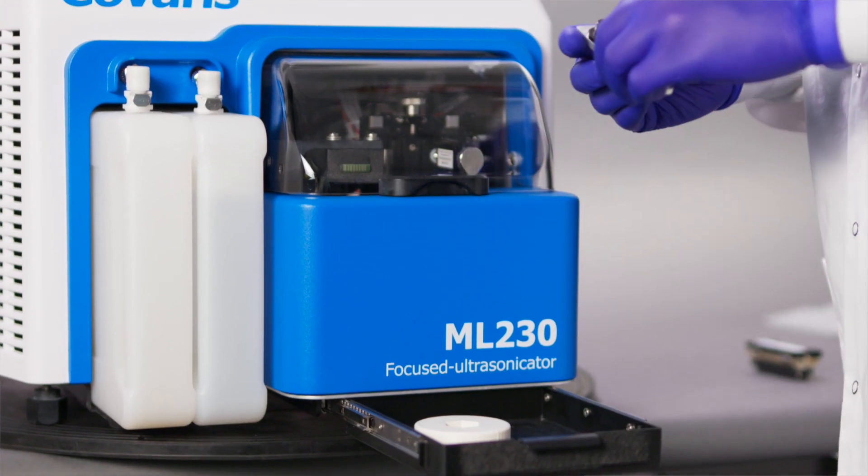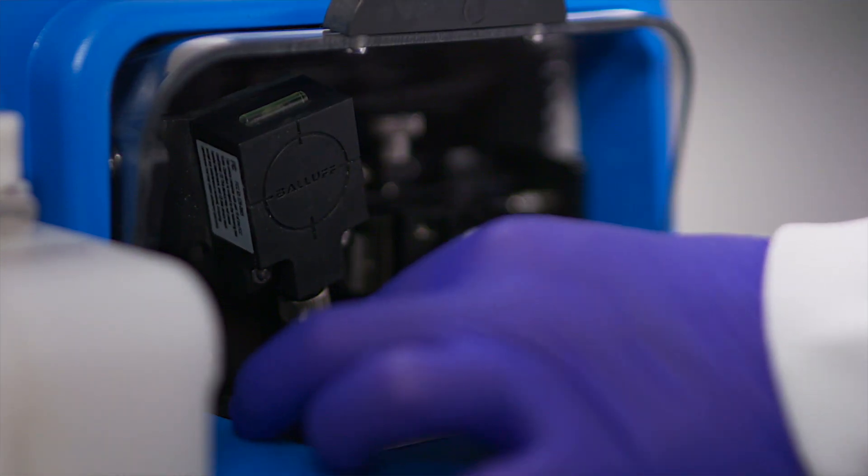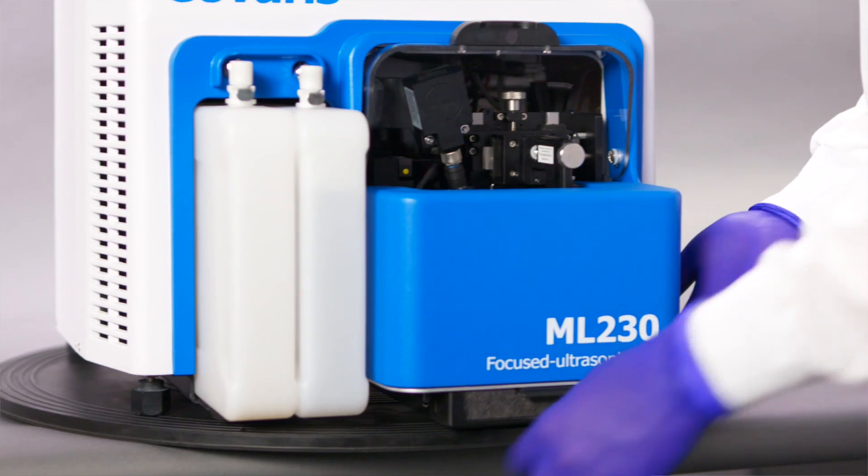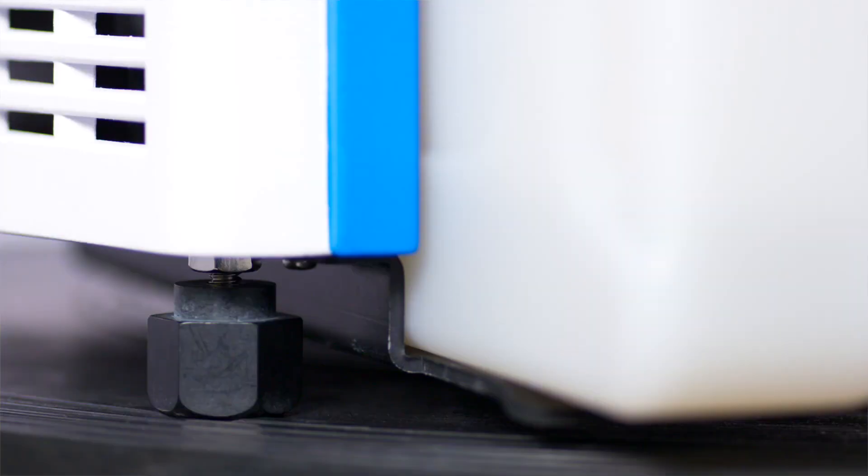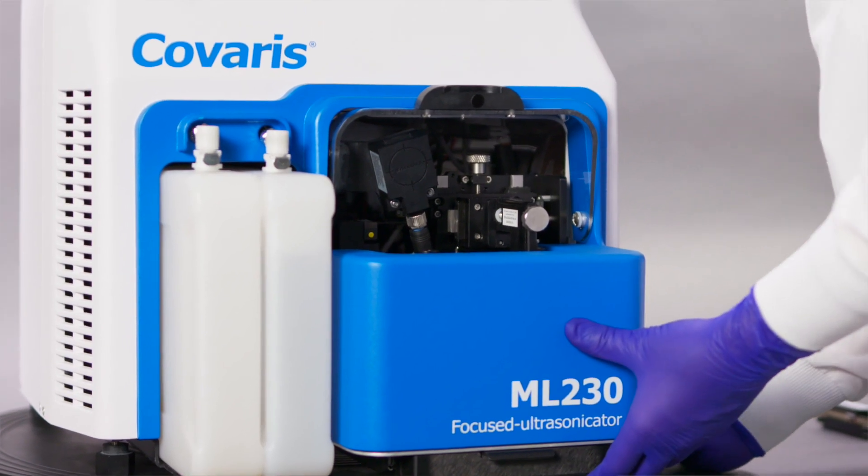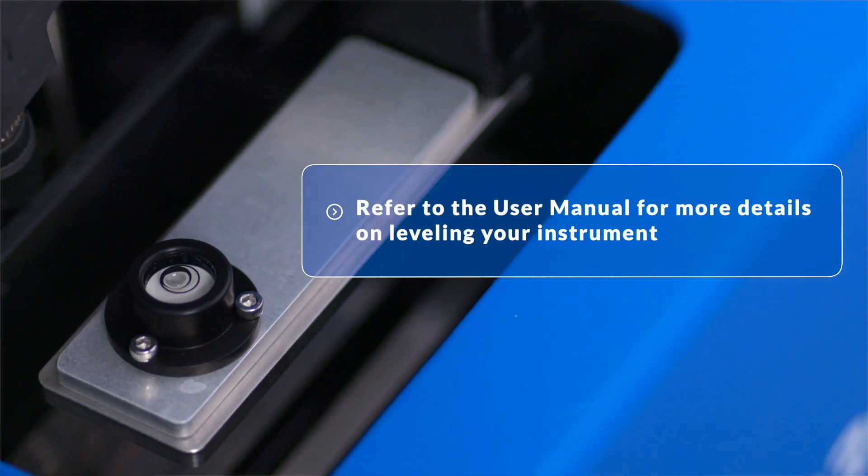Place the leveling fixture in the sample tray. Begin with all four feet turned counter-clockwise and close to the base plate. Adjust the feet by turning left and right to shorten and lengthen the feet as needed until level. The bubble will be in the center of the fixture sight glass. The feet can be adjusted by hand. No tool is required.